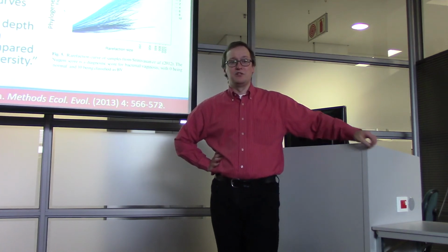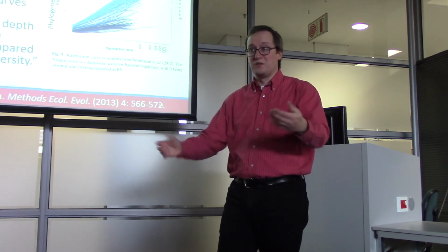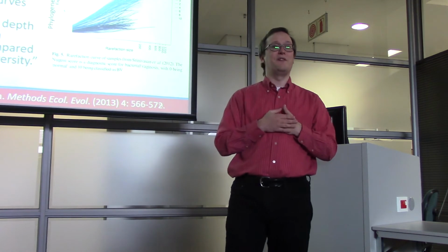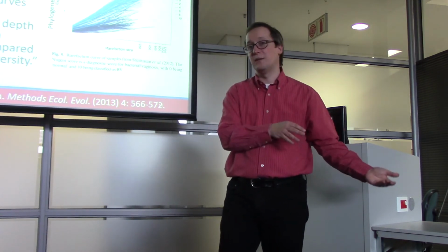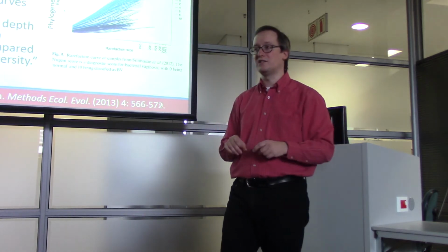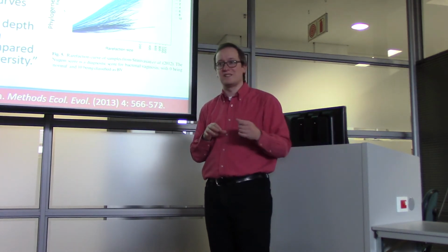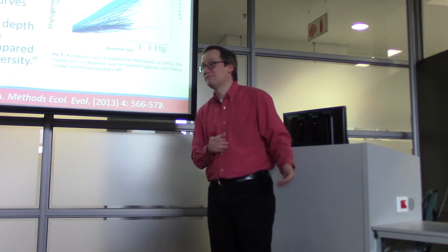So being able to work with results from these tools can also be problematic. You know, I've tried to find what is an appropriate proteome database for searching a proteomic sample if I know the 16S derived OTUs. But if I don't know which species is there and only know what genus is there, things get a lot harder to work with.